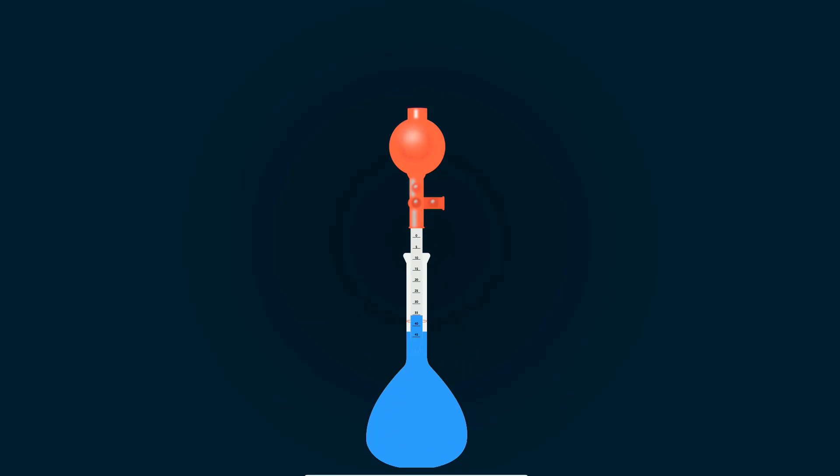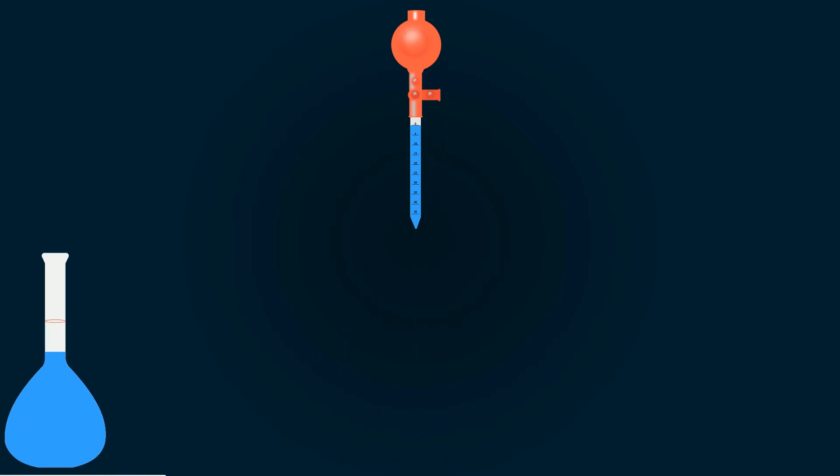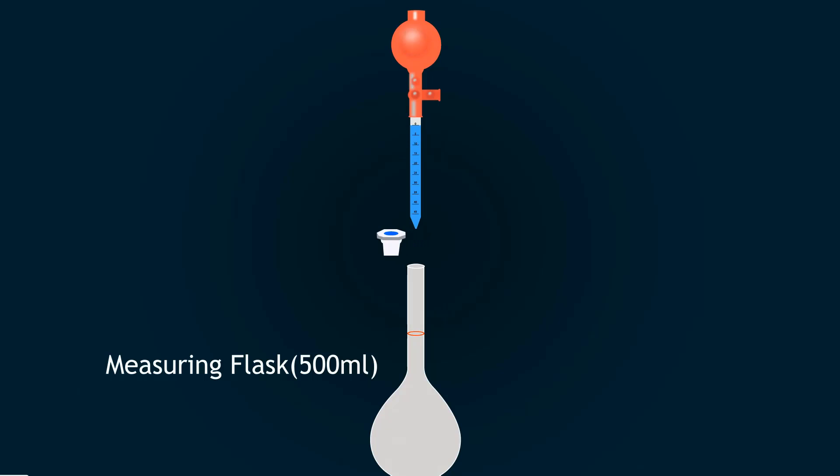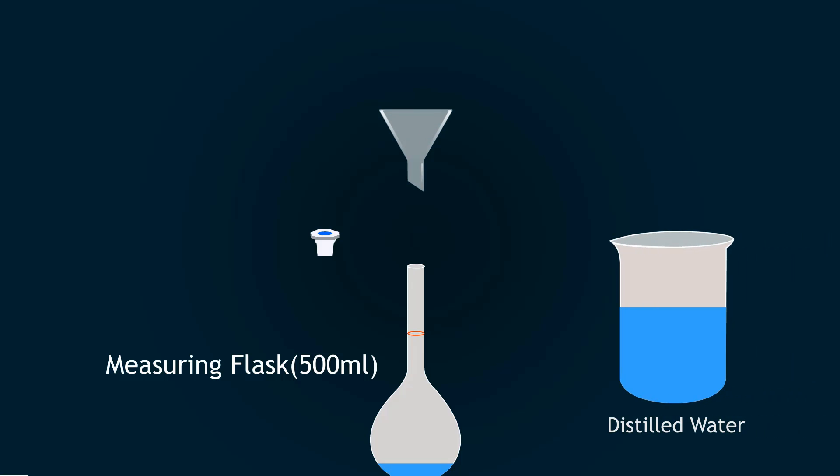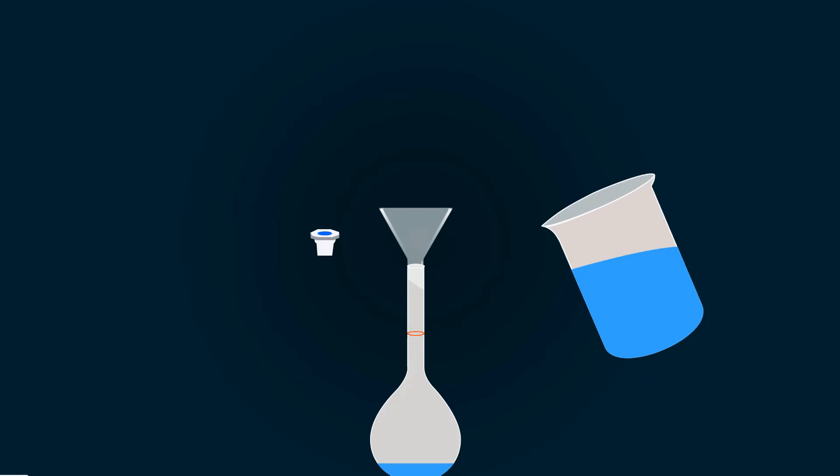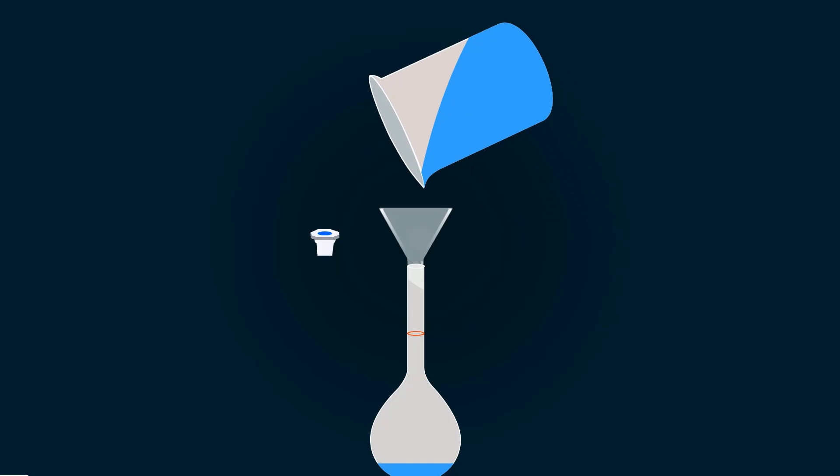Pipette out 50 ml and put it into the measuring flask. You can easily see the red mark which indicates 500 ml. To complete to this mark, you should add distilled water from the beaker.